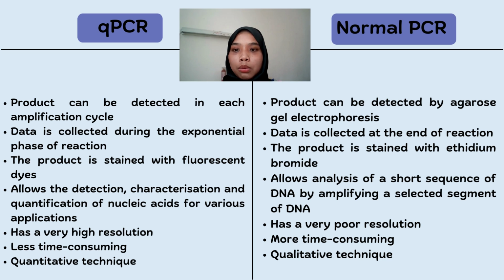Quantitative PCR also allows the detection, characterization, and quantification of nucleic acid, while normal PCR only allows analysis of a short sequence of DNA by amplifying a selected segment of DNA.